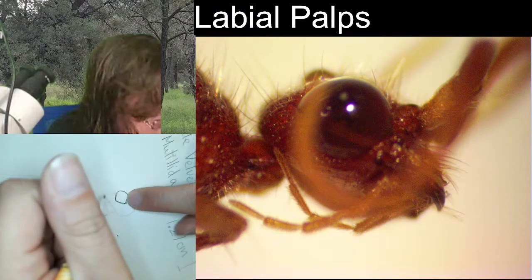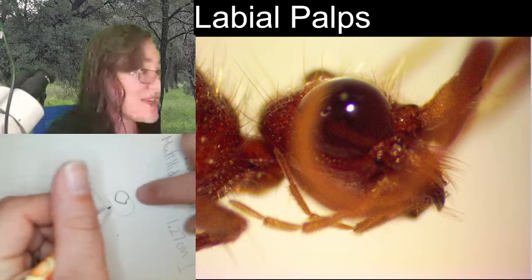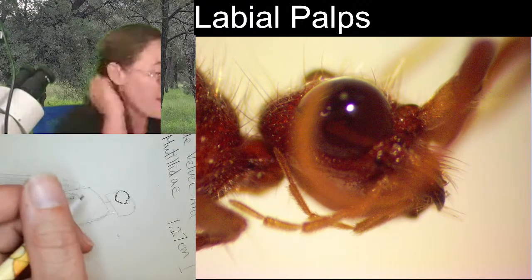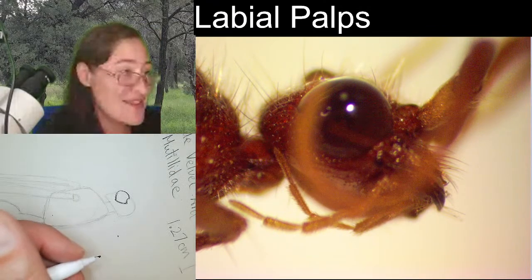Up here on the top of the head, because the compound eyes are bulbous so high above the head, we cannot see the ocelli from a lateral point of view.